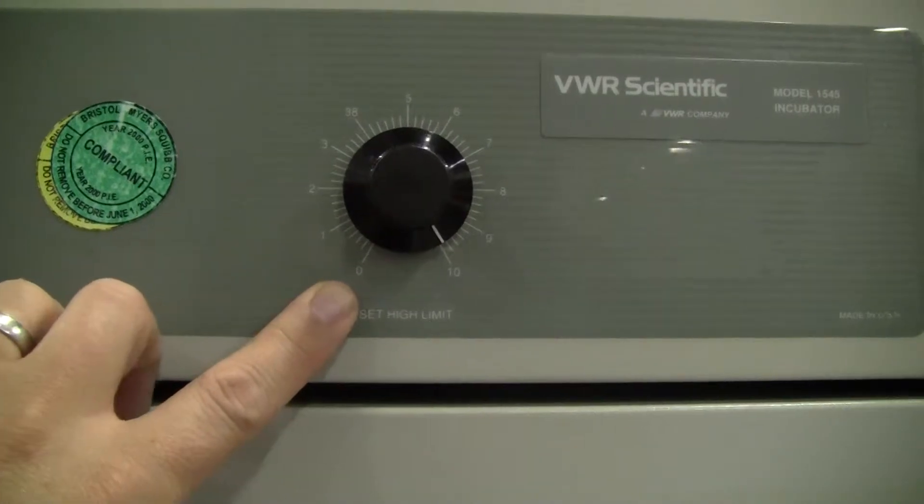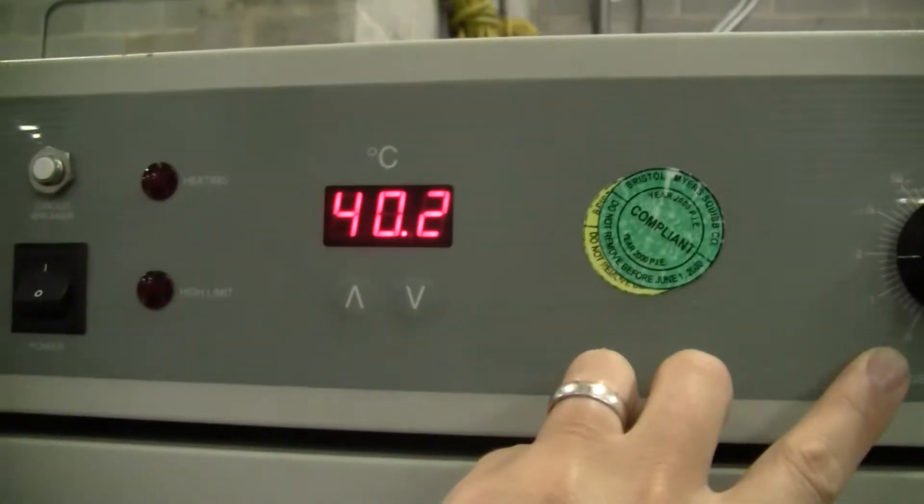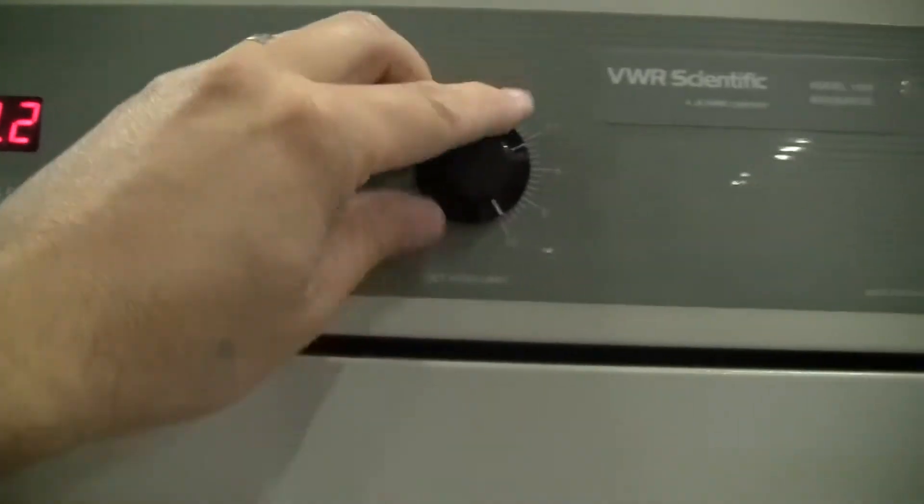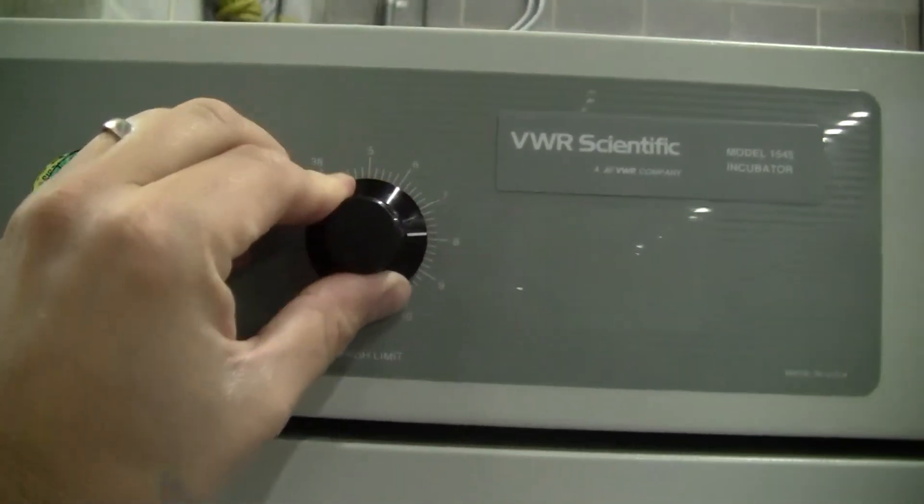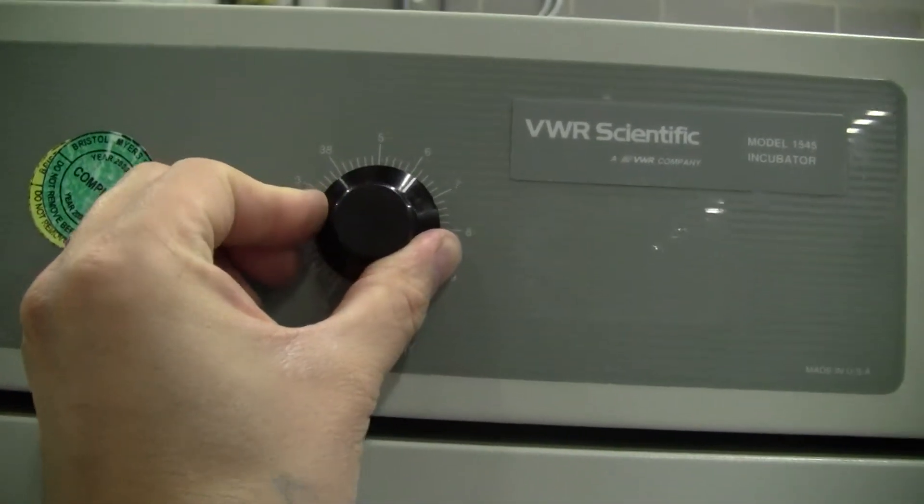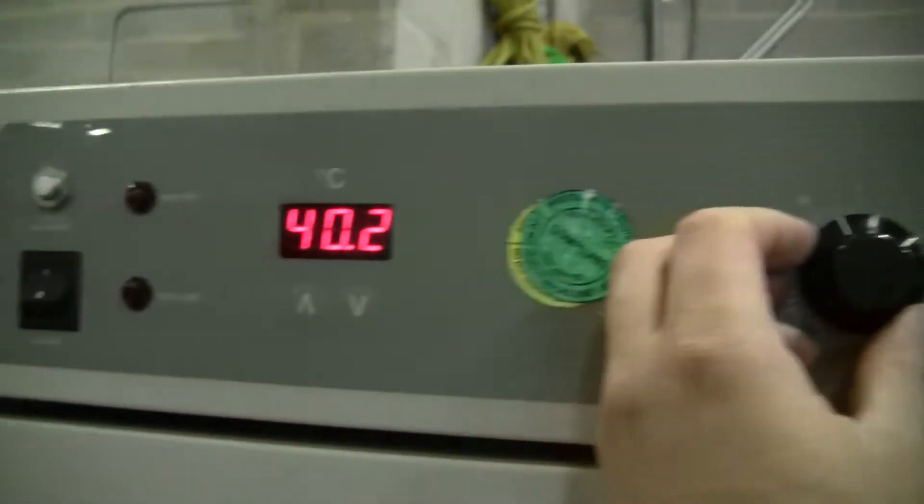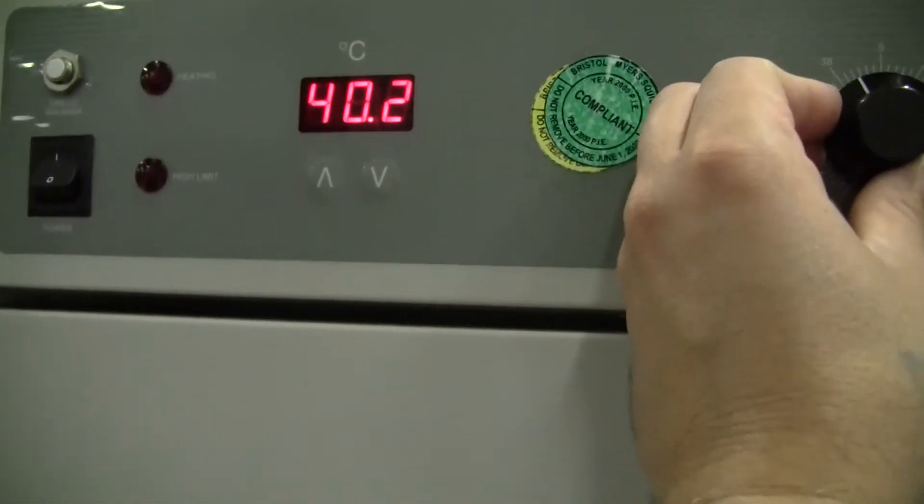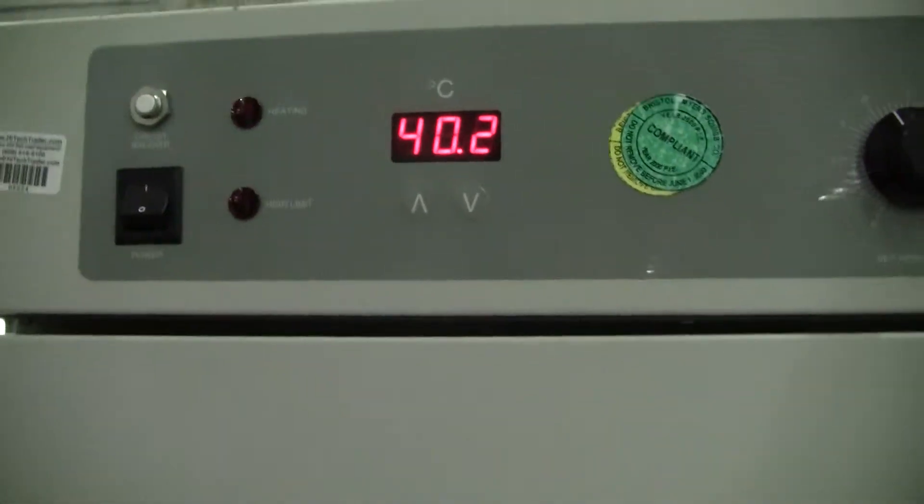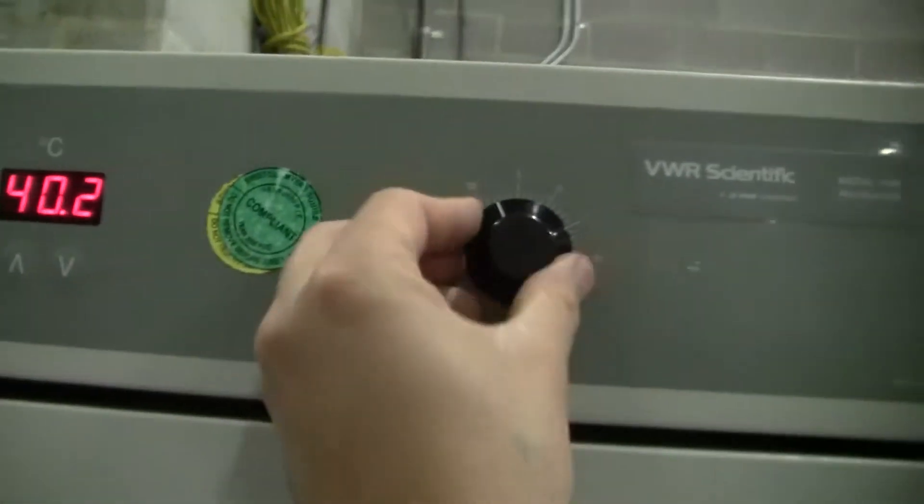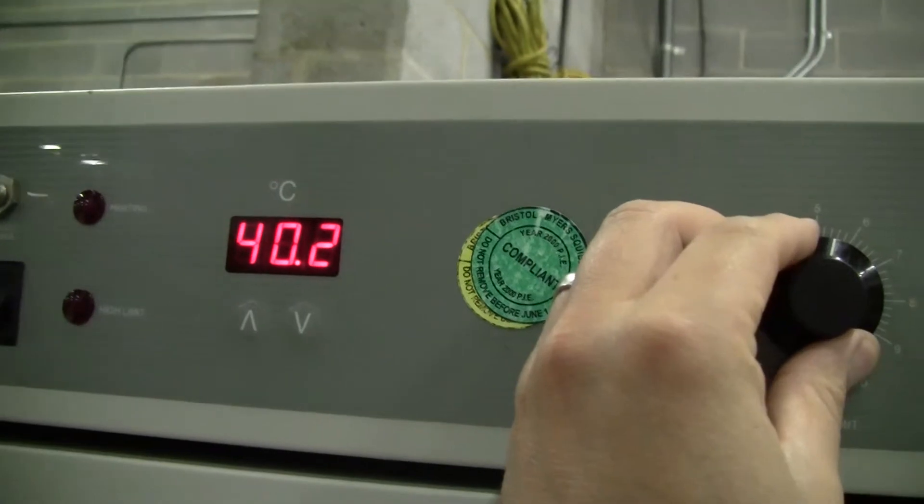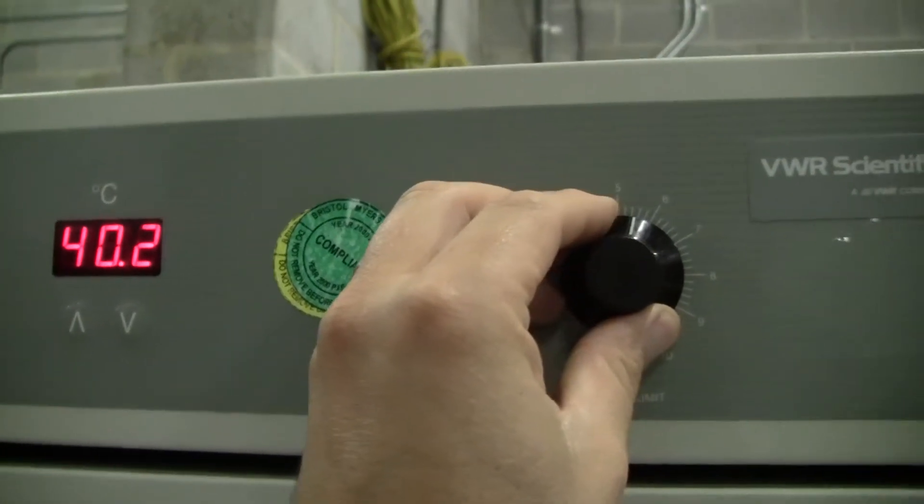The way the over temperature is set is once the unit is stable at a particular temperature, you dial back the over temperature until it clicks. So the over temp would now be set at 41.2 degrees.